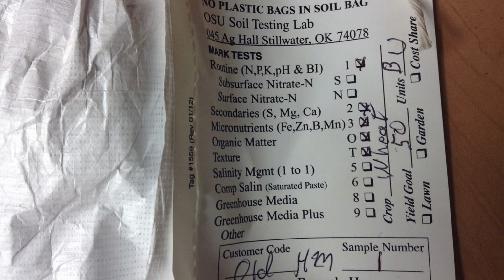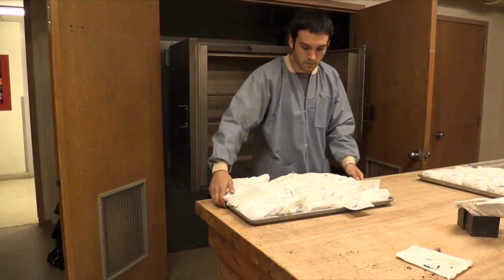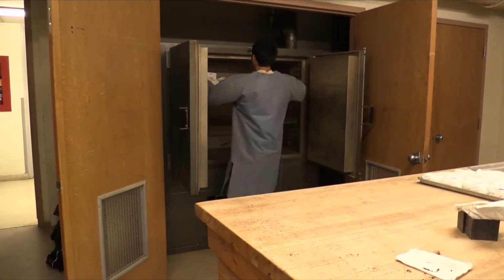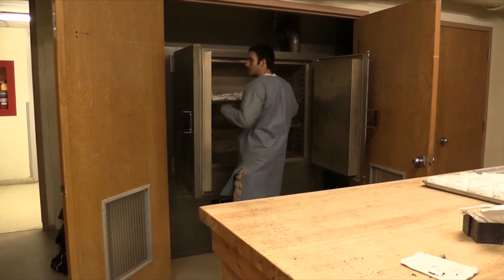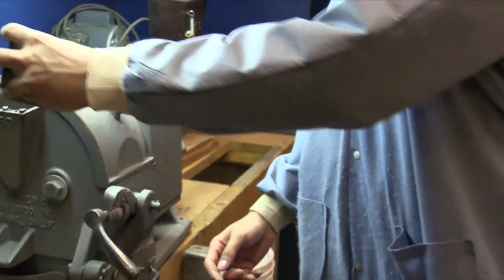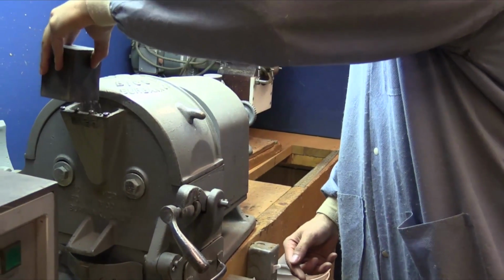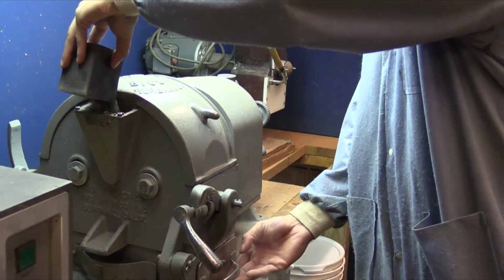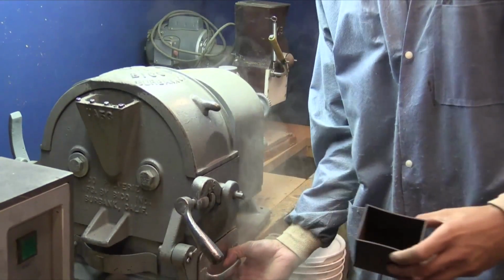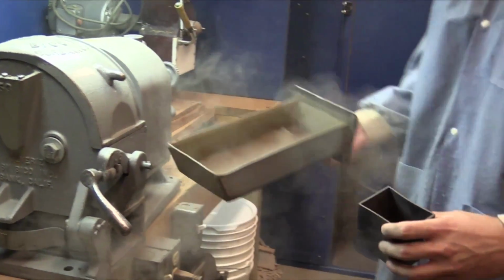soil test laboratory here. The first thing they're going to do is leave it overnight in the oven at 150 degrees Fahrenheit so that the sample is completely dried out, all dry matter. And then in the morning, they'll take out the soil sample and put it in a grinder and grind it to a fine powder. And then from there, that powdery, dry matter soil sample can go to a number of places.